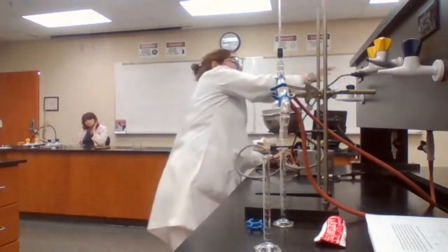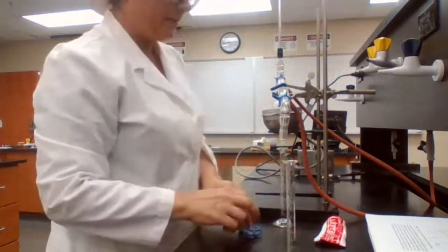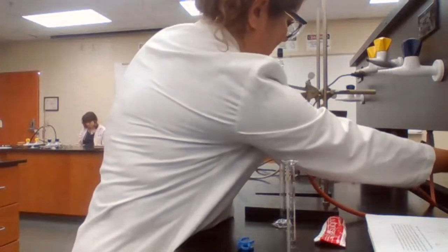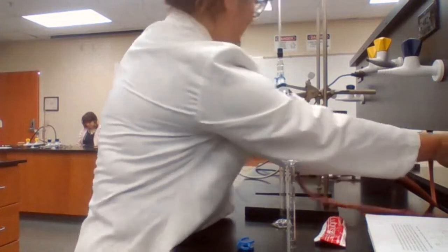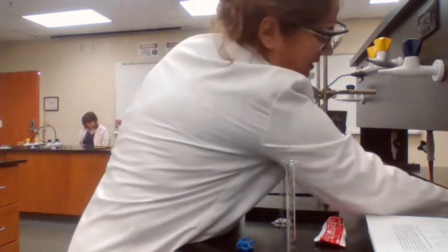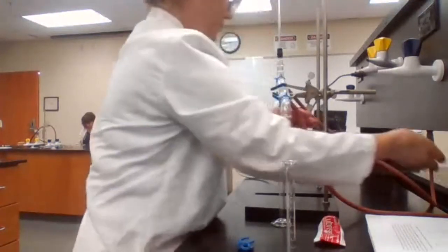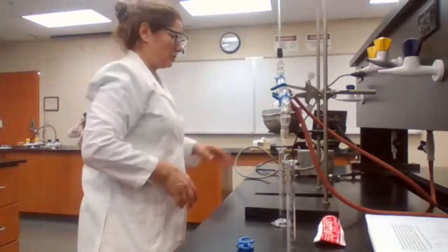So to start the experiment for distillation, to collect sample, first we are going to turn on the water. And to turn on the water, you have to go very gently, because if it's too fast, with high pressure, it's going to cause water splash. So we try this very gently, and sometimes the hoses that I'm using are old, but if you go very gently, it should work.